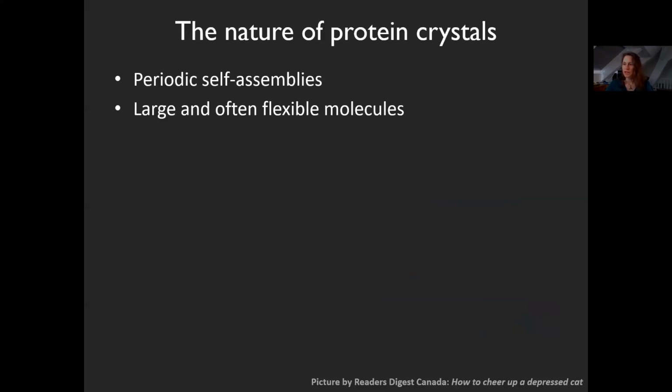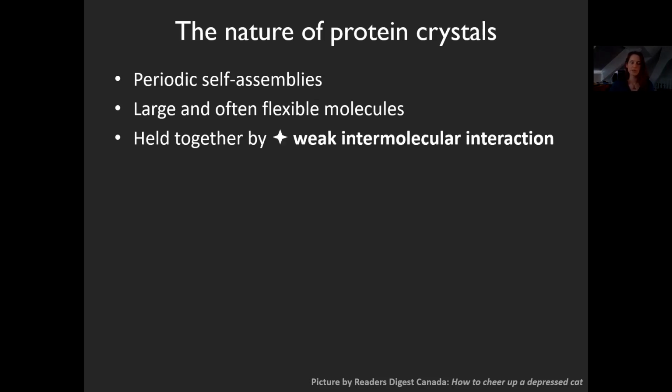There are periodic self-assemblies, and as I just said, the proteins are large, flexible molecules held together by weak intermolecular interaction. So protein crystals are actually quite soft.